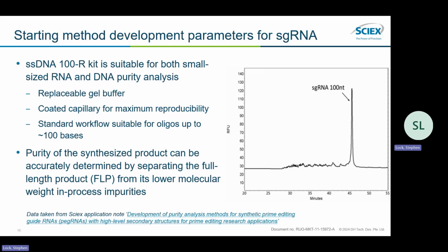So the way the system works is that it's an empty capillary. You fill it with the gel, you inject your sample, then the sample is separated as it flows down this gel matrix, which acts like a sieve. And then afterwards, you clean out the whole capillary again and redo the process. And this really allows you to look at the synthesized products.